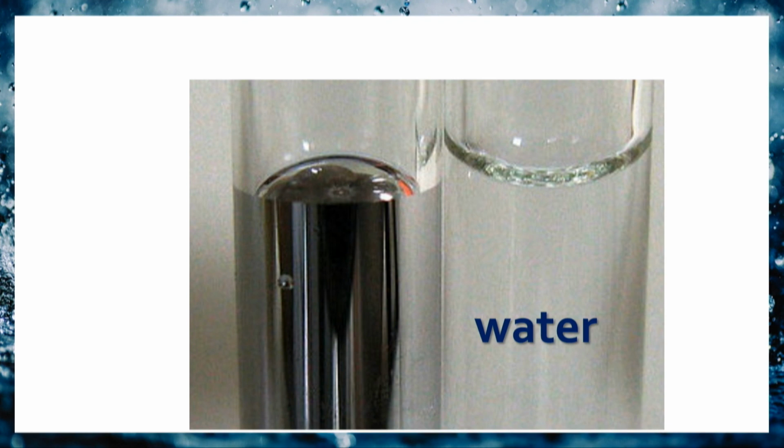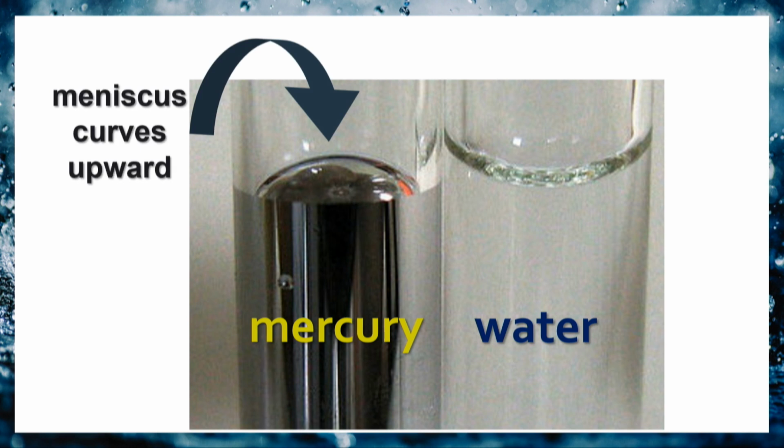Similarly, the volume of most liquids can be obtained by reading the lower meniscus. However, for the volume of mercury, which is a liquid metal at room temperature, we have to read the center of the upper meniscus, since the meniscus of mercury curves upward.